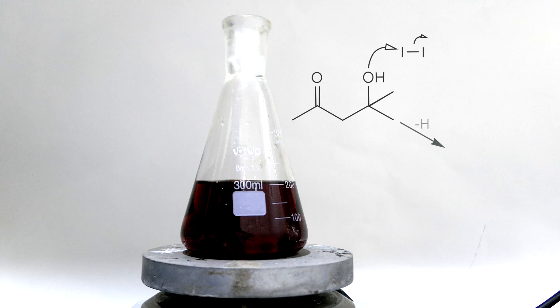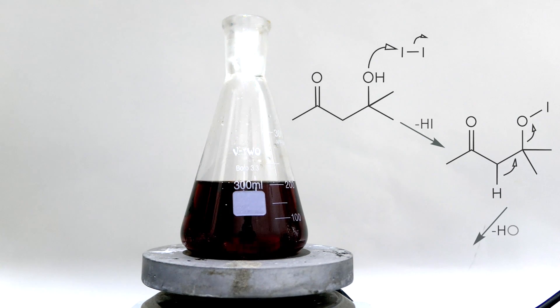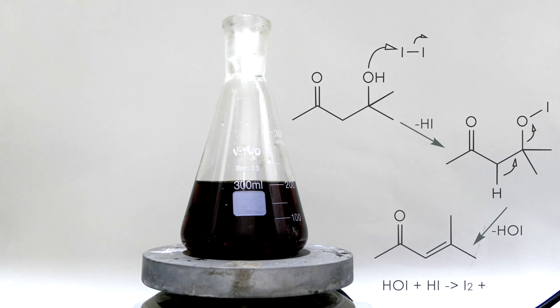First, iodine reacts with the hydroxyl group to form an oxygen-iodine bond with loss of hydrogen iodide. Then, this newly formed hypoiodite group is a good leaving group, thus promoted elimination and generated alpha-beta-unsaturated ketone. After that, hydrogen iodide and hypoiodous acid react together to regenerate the iodine catalyst.